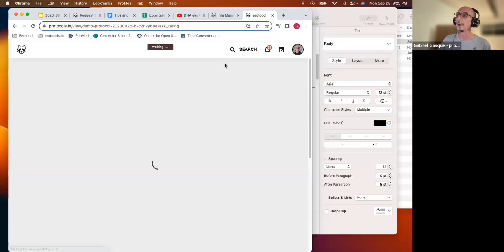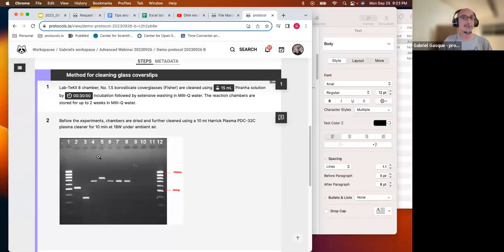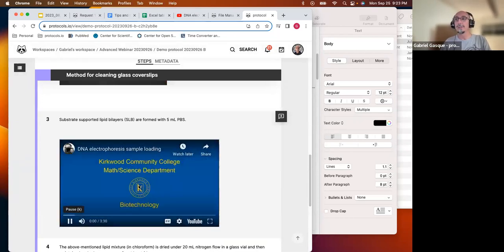And if I go to the viewer, I see the image that I just uploaded. And I can also see the video, not as a hyperlink, but actually as the video itself, which can be run.